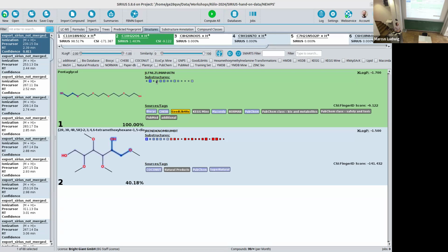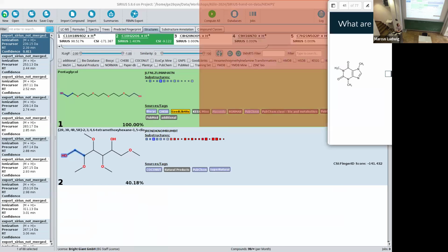Then we have a structure representation of your molecular properties, of the fingerprint. These are the boxes here. They look a little bit funny at first, but they help you to get an idea of what molecular properties are predicted. To give you the idea of what that means, we even have some slides, because it was always hard to explain. So I just use this.